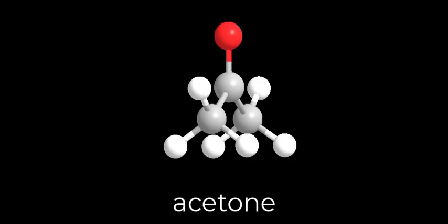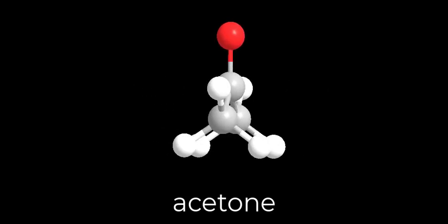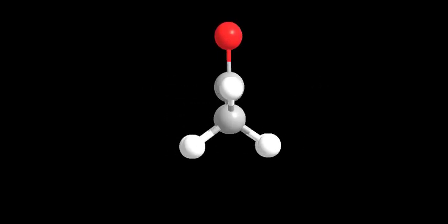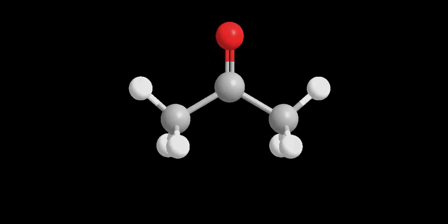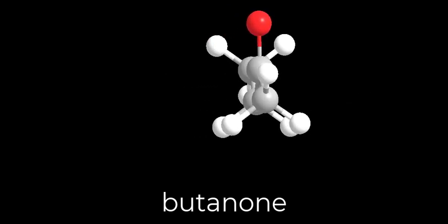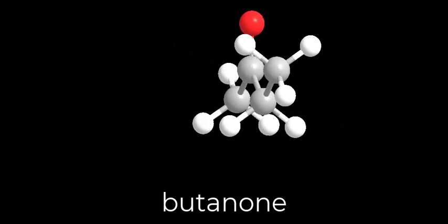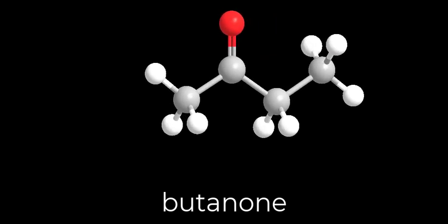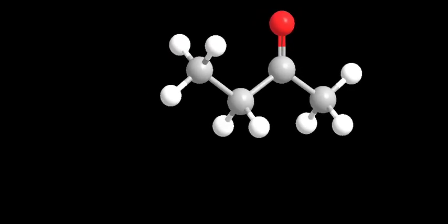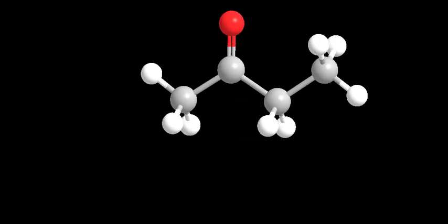Here is our first ketone. It is the compound called acetone. Acetone is, again, a common name. This compound is called butanone or 2-butanone. In either of those cases, those are both the IUPAC name. You are asked to find the common name on your lab report sheet. That's pretty easy to do. You can go ahead and Google butanone and you'll find that. I'll give you a hint. Its abbreviation is MEK.